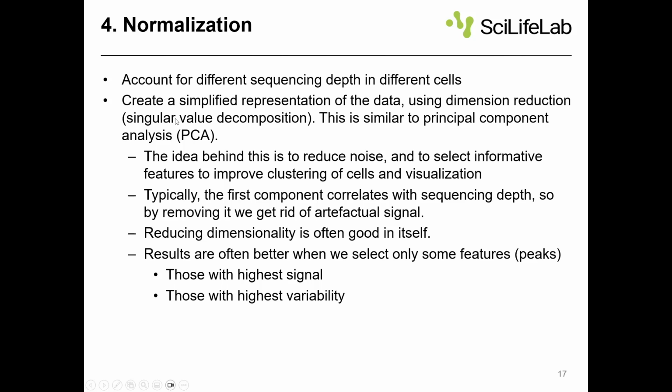Sorry, Jakub, I had a question. So what do you mean by more rare peaks will be valued more? Like peaks found in fewer cells? Yes. Okay, but still over some sort of a threshold, I'm assuming. Yes. So first you do peak calling, and then you need to get up to a certain threshold for this peak to be called at all. If it's just exactly one read, then it's just noise.